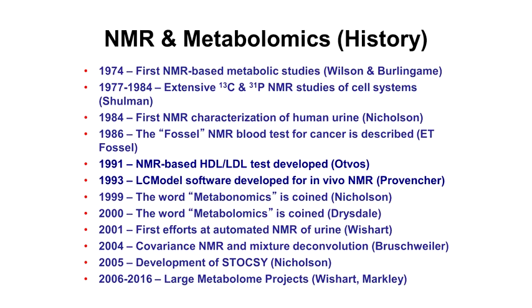In the early 1990s, a Canadian scientist was looking at MRI spectra in the early days of chemical shift imaging, and realized that you could actually deconvolve NMR spectra and detect and quantify a number of metabolites.